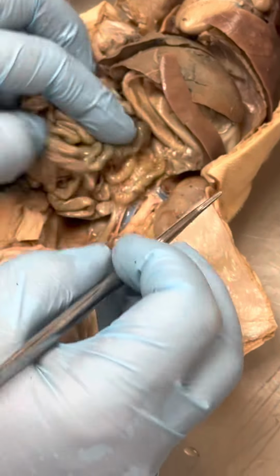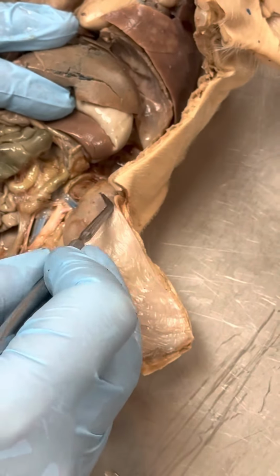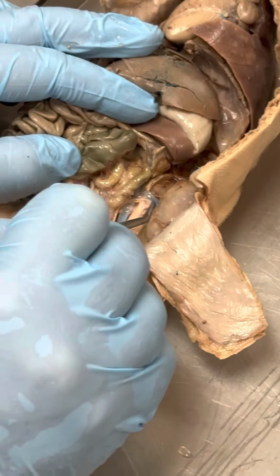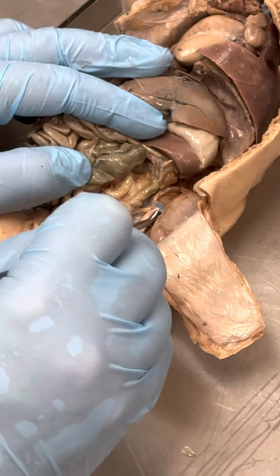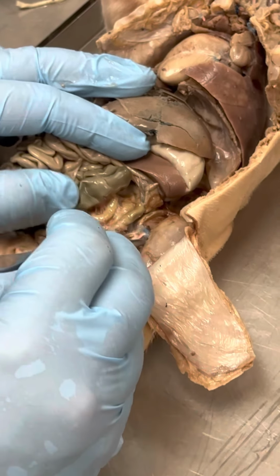Renal. Renal, think kidney. There's a butte right there. There's a kidney. There's a renal vein. There's a renal artery. So you can actually see those pretty good. But if you just say renal vessel, it's fine with me.